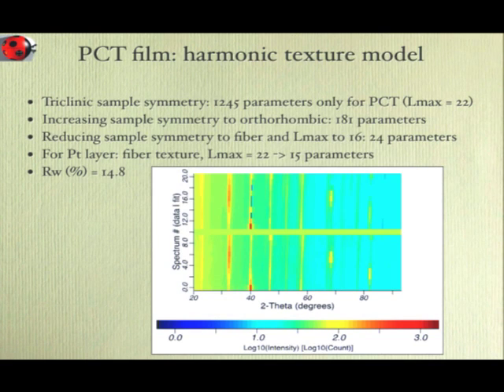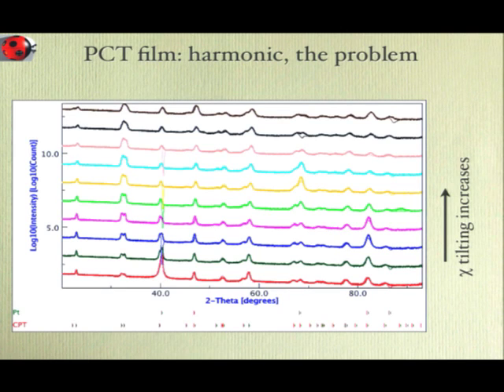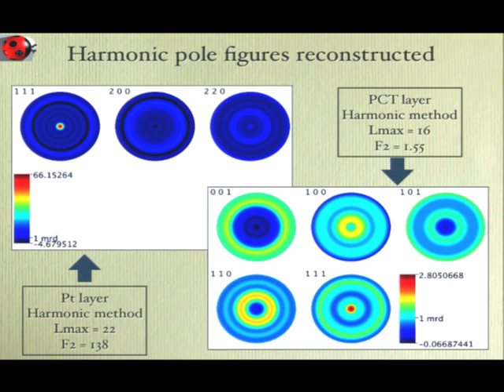What is happening? If you don't cut the negative part of the harmonic, and you should not allow it to do that, then the pole figure doesn't represent your ODF anymore. You get some negative points, because the harmonic, trying to fit the sharpest, highest part of the ODF, creates some negative points. The problem with the harmonic is that you cannot use an infinite expansion of L, so you have no possibility to fit sharp texture correctly. You see some small negative parts, and some big ones there.